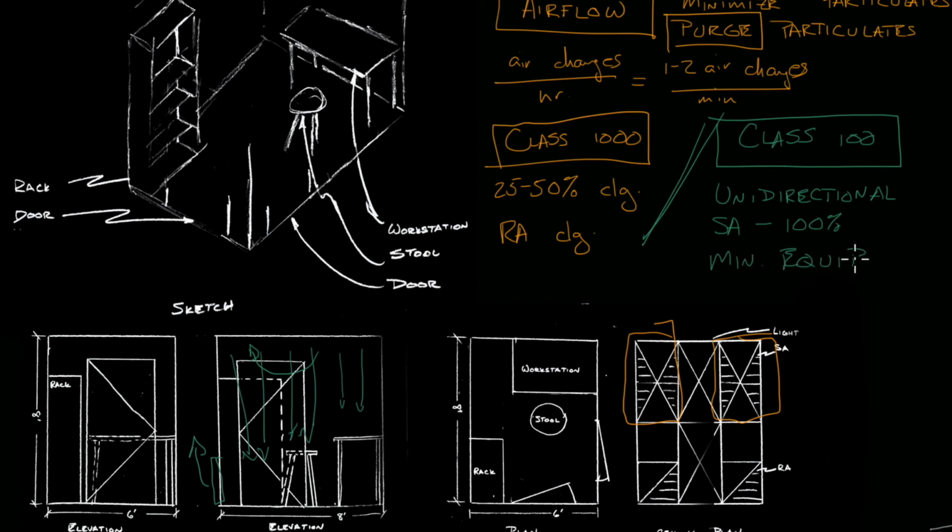So the stool, can't use it. And in addition, this desk is going to cause problems. It's going to cause eddies down here. So one solution is to get rid of the desk. No matter what, we want to minimize the workspace.